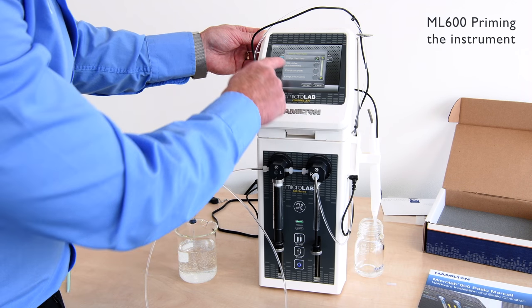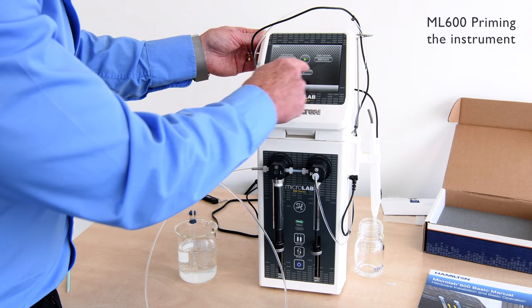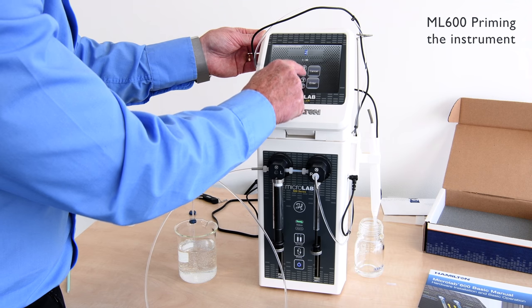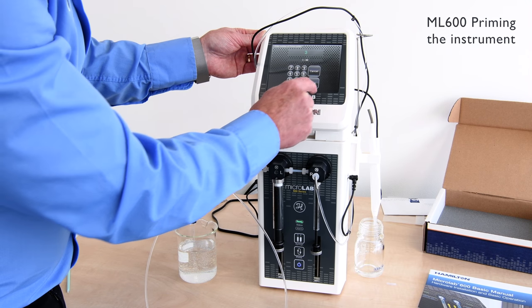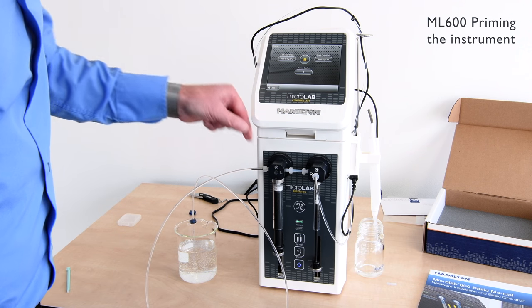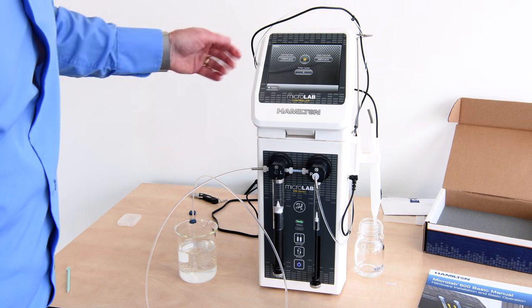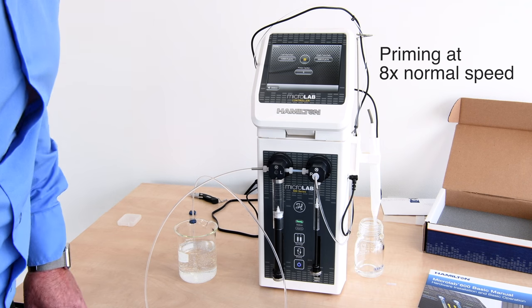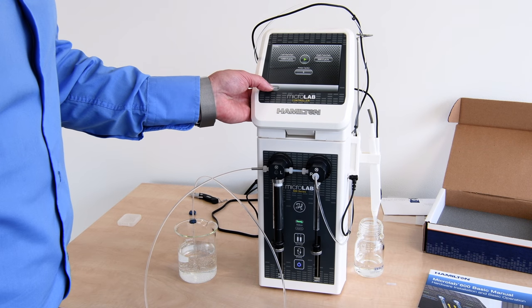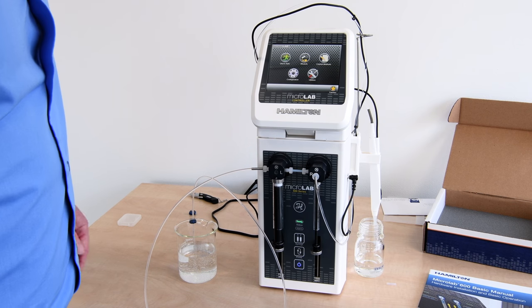Here we can select from slow speed up to faster speeds, which is fine. We can then select the number of cycles we want to run — here I'm going to set it to three cycles — and initialize this as a program. Pressing process, it will now complete three cycles of the syringes to ensure we are degassing the fluid line. You can now go back in the menu program to look at the options for running the system.